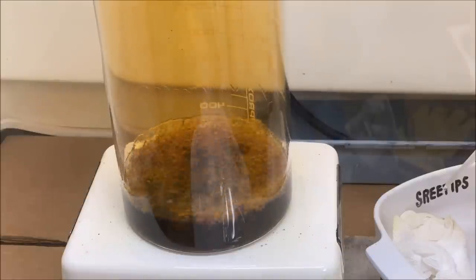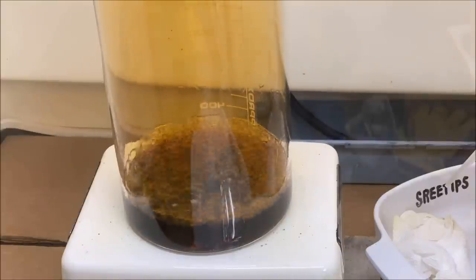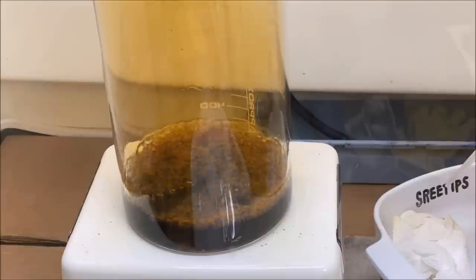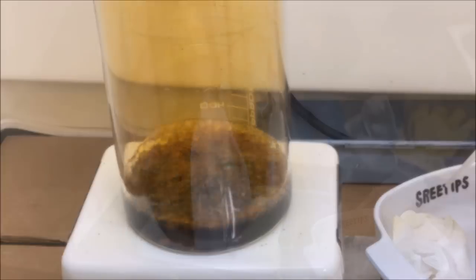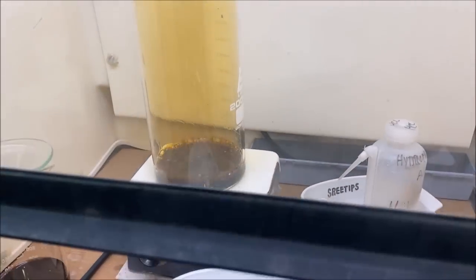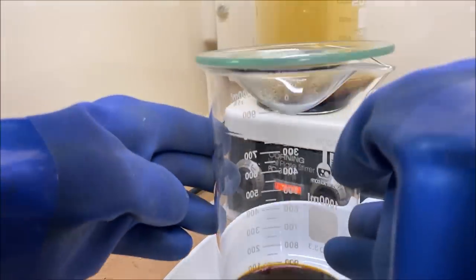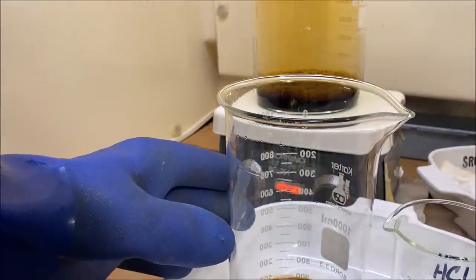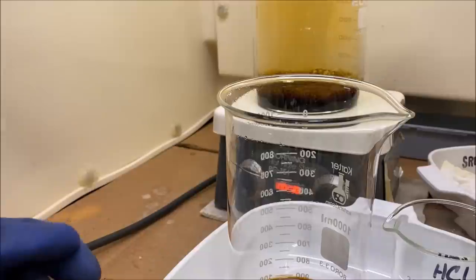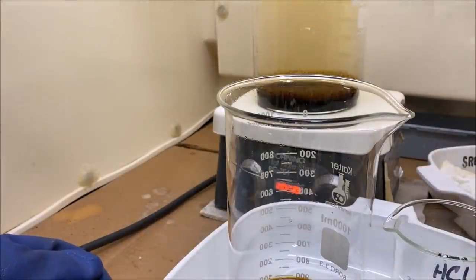What we're trying to do here is put the platinum in solution with aqua regia. And up to this point, I haven't kept track, but I've put multiple doses of hydrochloric acid into the reaction, multiple doses of nitric acid into the solution. Platinum does not like to dissolve very well in hot aqua regia. And I think I've been at it now about 6 hours.